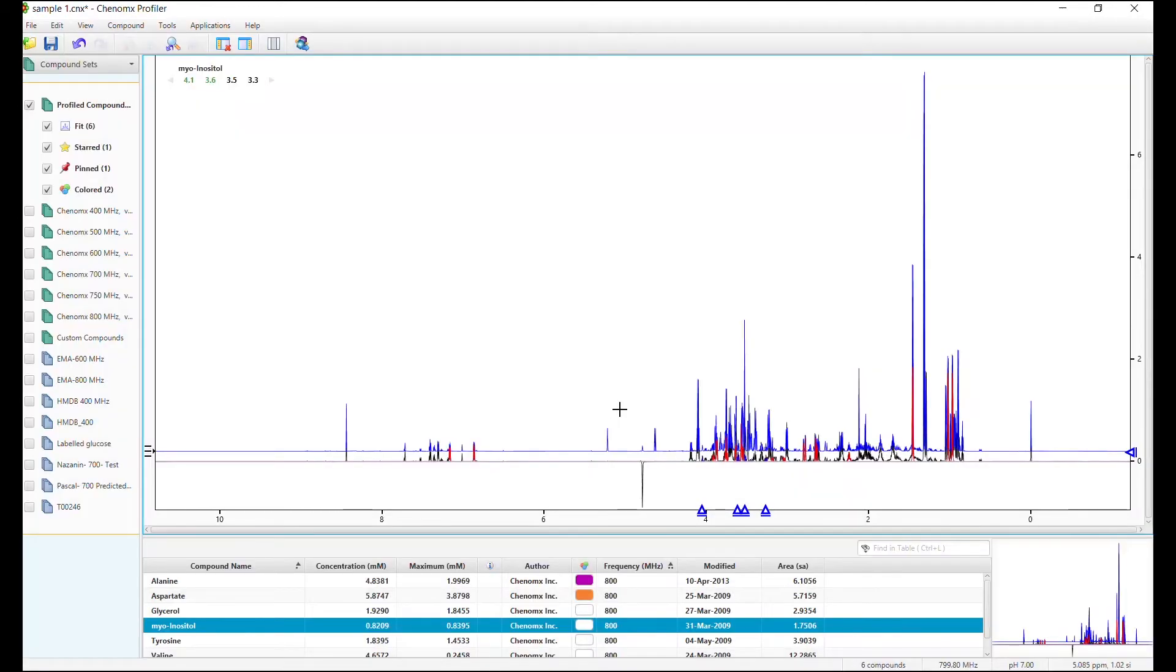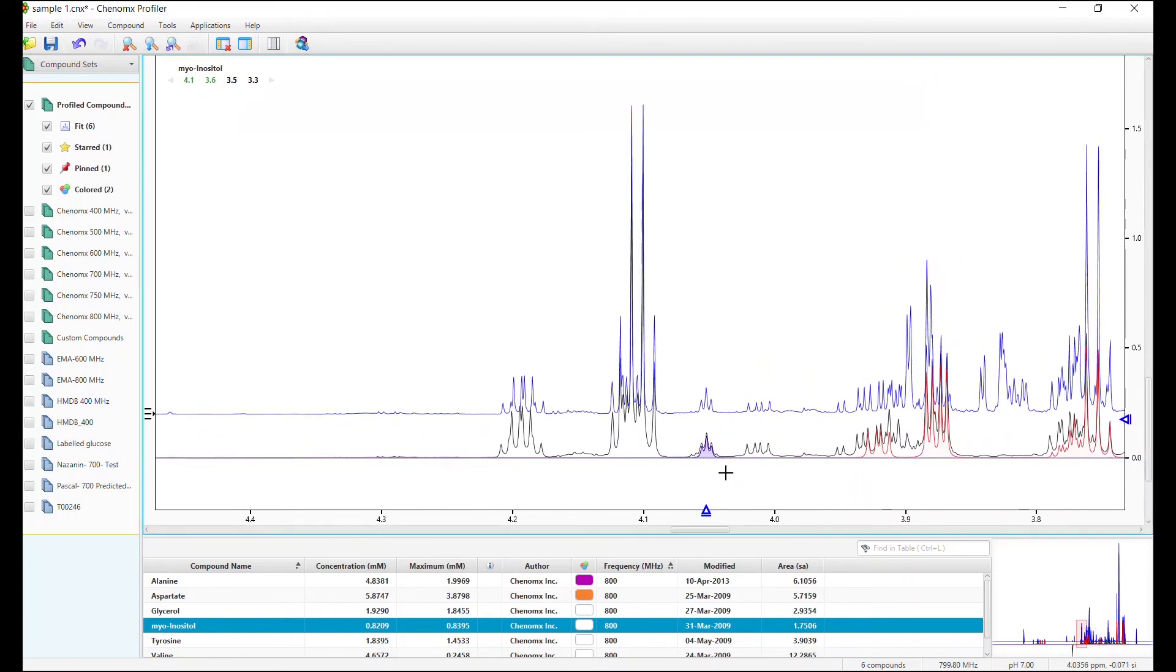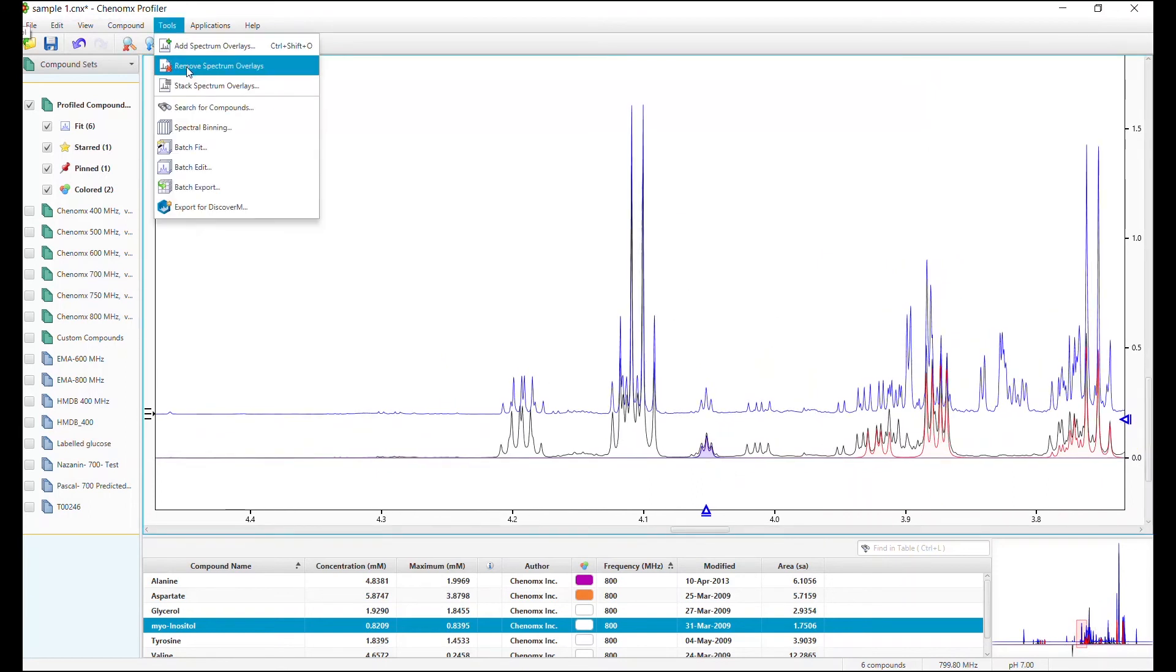And look, much easier to compare. Tools, Remove Spectrum Overlay and it's gone again.